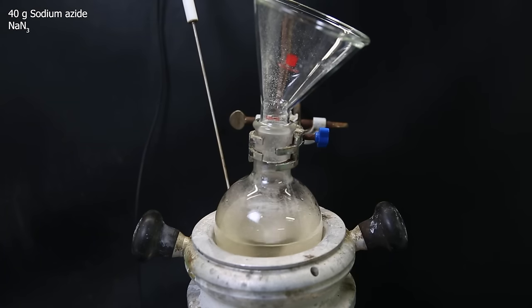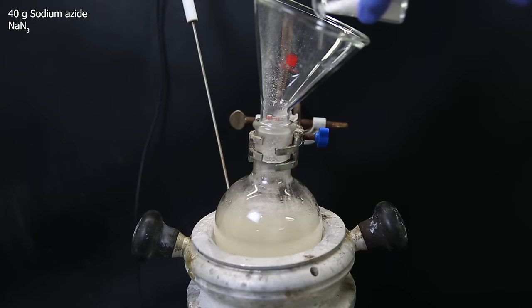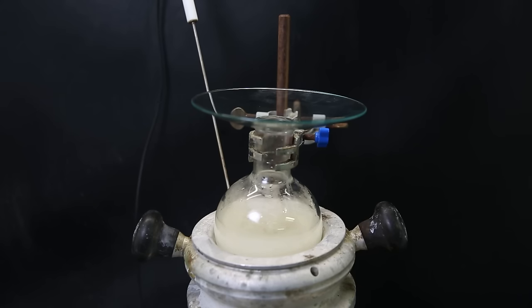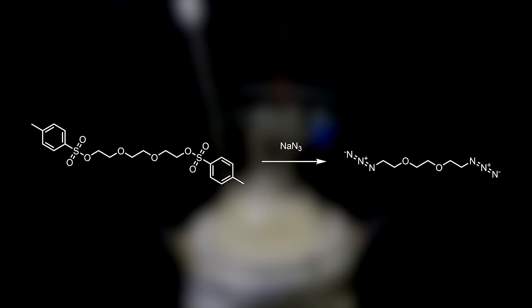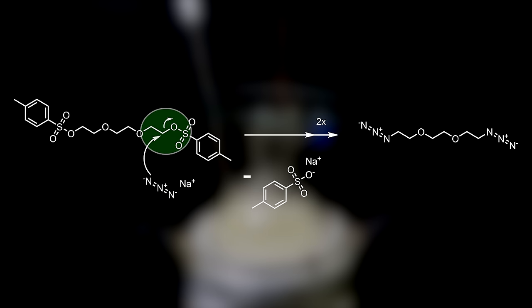Then I gradually add 40g of sodium azide, which is why I removed all of the DCM before, since having sodium azide, DMF and DCM together can cause the sodium azide to react with the DCM to form diazidomethane, which is a potent explosive. Anyhow, in this reaction, the ditosylate reacts with the sodium azide to form the diazide. The azide ion attacks the carbon adjacent to the tosylate group, and the tosylate is kicked off, forming sodium tosylate with the remaining sodium ion. This happens twice to give the diazide product.